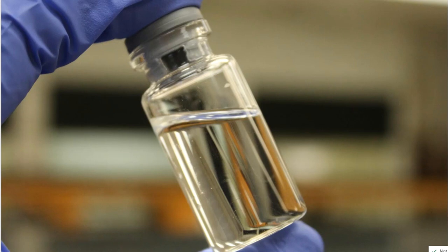So here's my unknown liquid. My unknown liquid was labeled with a G. All right, so we have unknown G here. And I need to go through and figure out what this unknown liquid is going to be based on the table that they give me in the lab procedure.